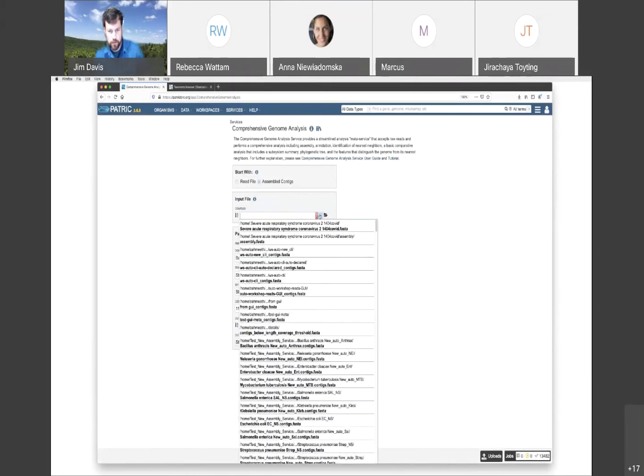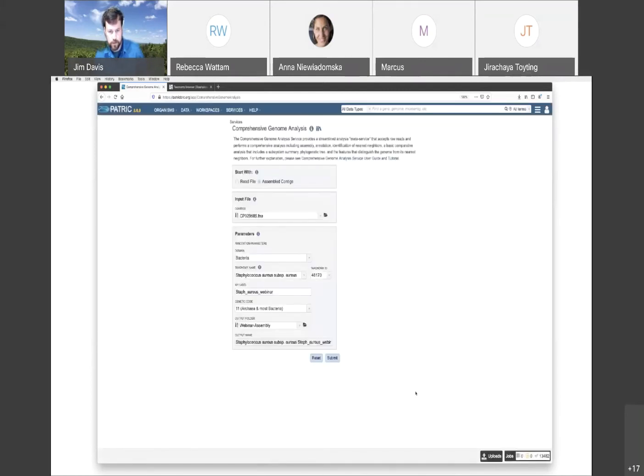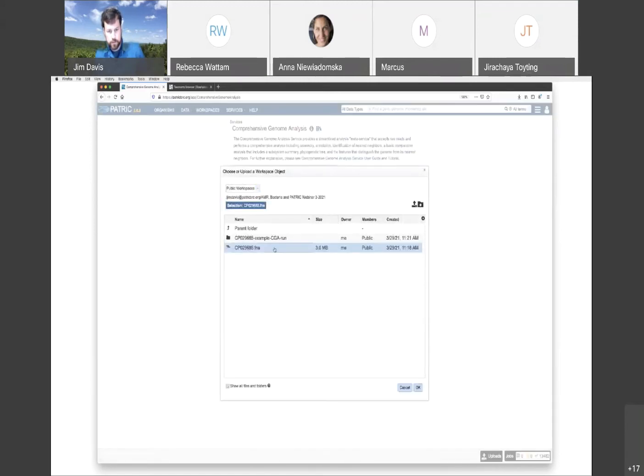Now, oh no. Let's see here. It didn't make my contigs again. There we go. I don't know, this was working.